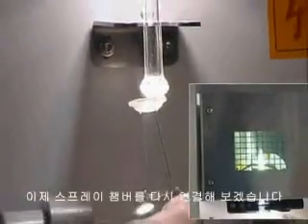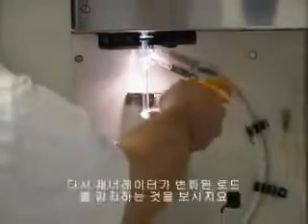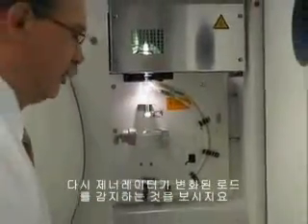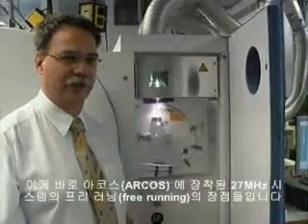And we're going to now reconnect the spray chamber. And again, the generator adapted instantaneously to the change in load, showing the advantages of the free-running 27 MHz system that's installed in the ARCOS.